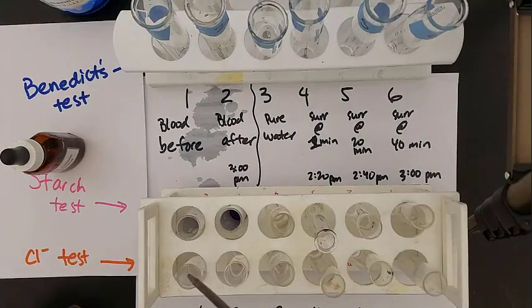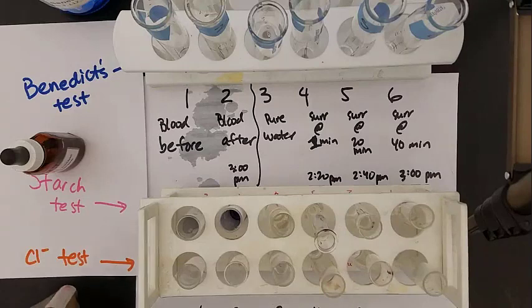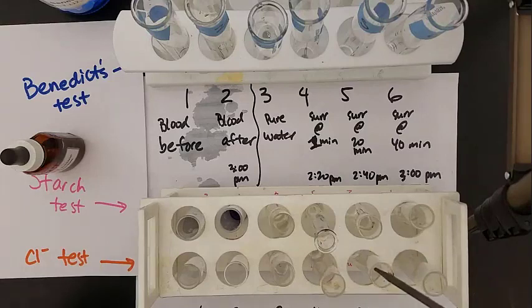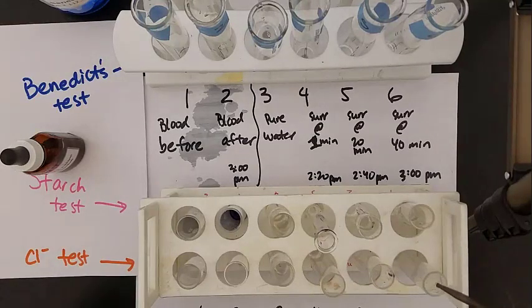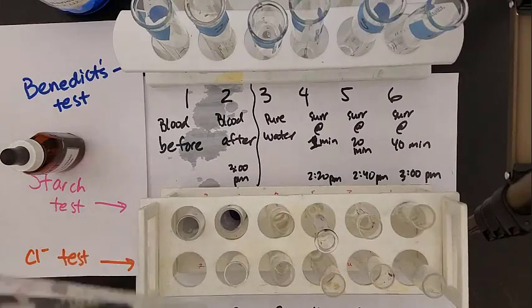Next we'll test for chloride. Sodium is hard to get a good reaction, so we'll test for chloride instead. We add a couple drops of silver nitrate into each test tube. Silver ions react with chloride ions to give a white precipitate. We'll mix those and take a look at each test tube in a second.